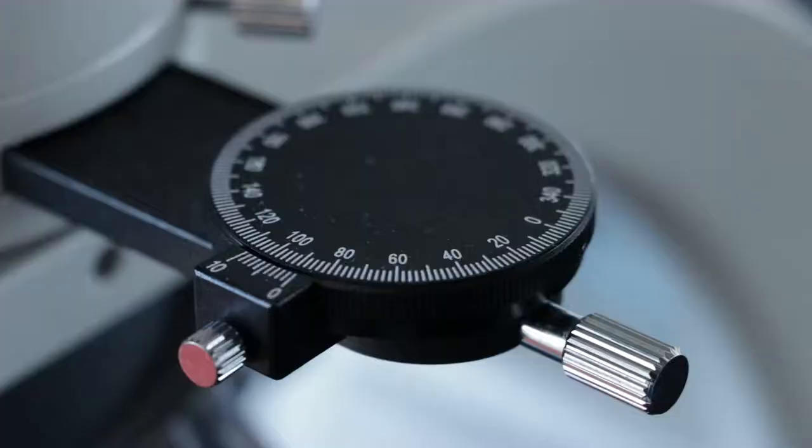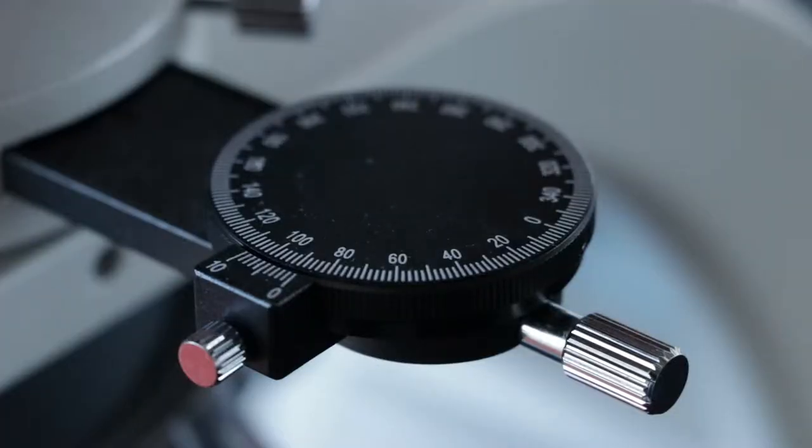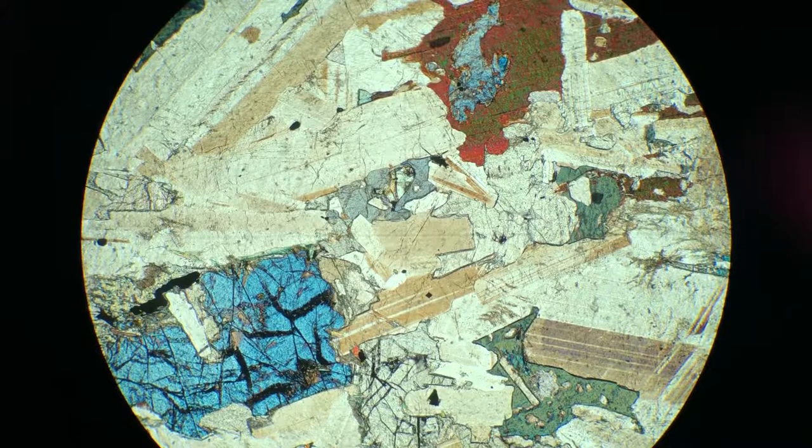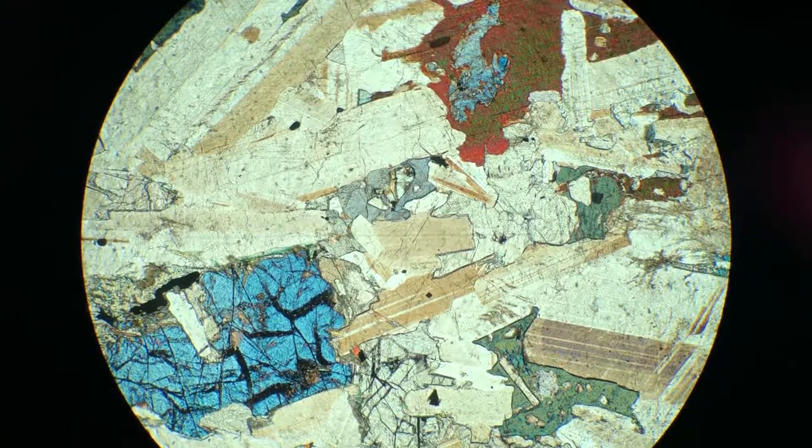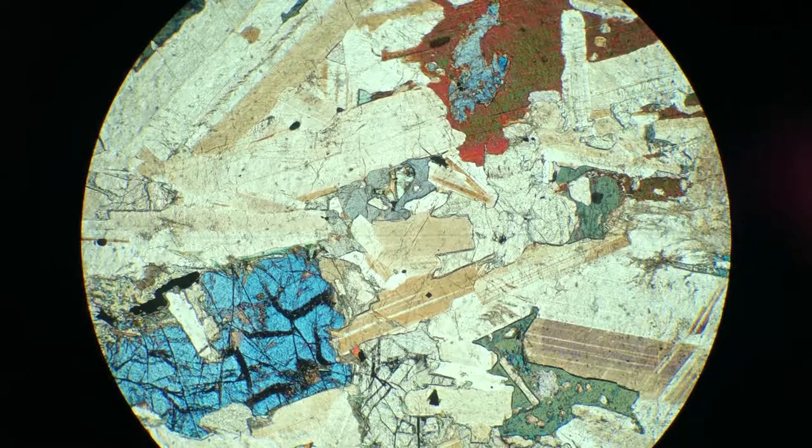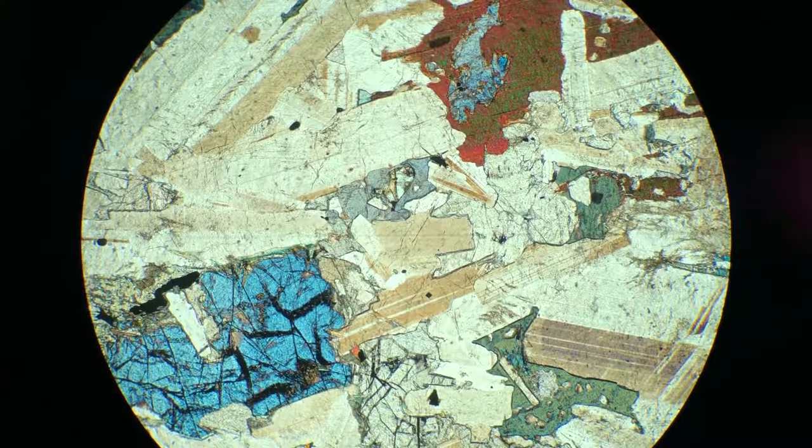This is the same thin section, with the analyzer in the wrong orientation. Have a look at the elongated plagioclase crystals. The twinning lamellae of the feldspar are now white, pale, beige, and brown, or can even turn purple.